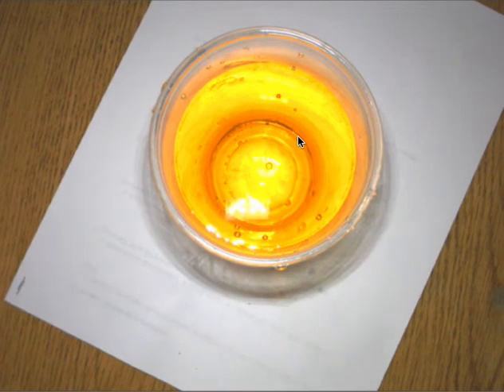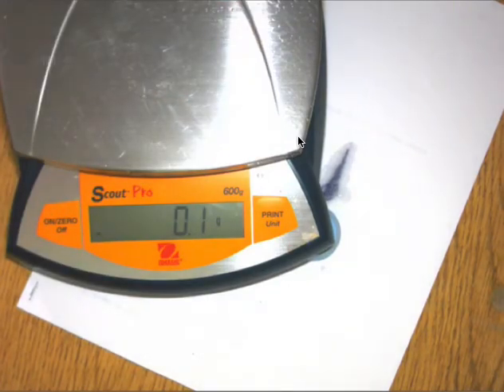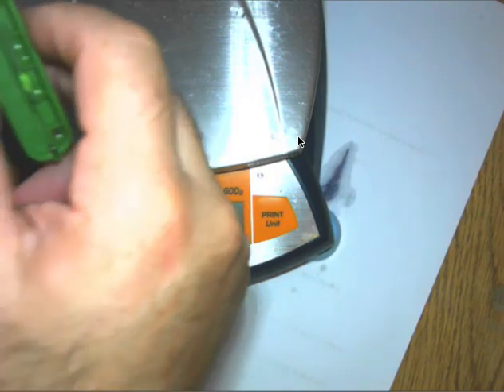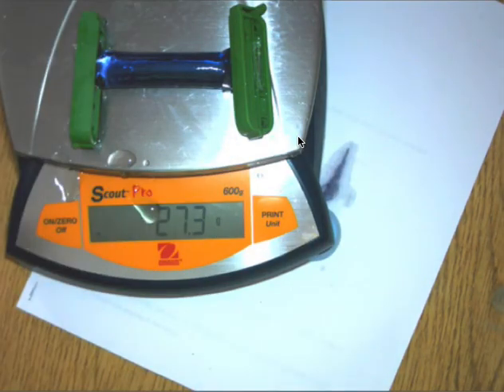Now, it says, let's take a look at finding the mass. Let's try to move our scale here. I'm going to measure it now. What does that say? Oh, got some water there. All right, our mass is now 27.3. All right, so we added some iodine.